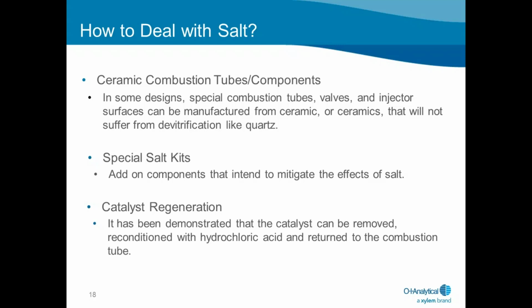And a very unique one, catalytic or catalyst regeneration. Some practitioners I know remove the catalyst, recondition with hydrochloric acid, dry, and return the catalyst to the combustion tube. While this may restore the catalyst, the devitrification of the combustion tube itself can still occur.